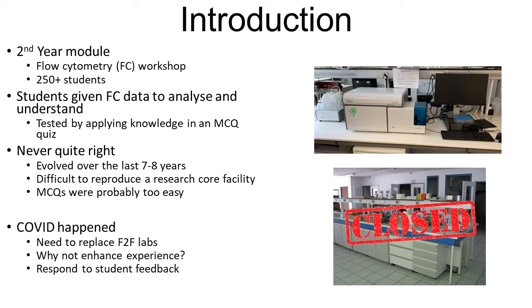Specifically today, I'd like to focus on one of the coursework elements, flow cytometry. You can see a flow cytometer here in the top panel. It is a core piece of equipment costing £75,000 to £100,000 and is capable of measuring 100 to thousands of cells per second.